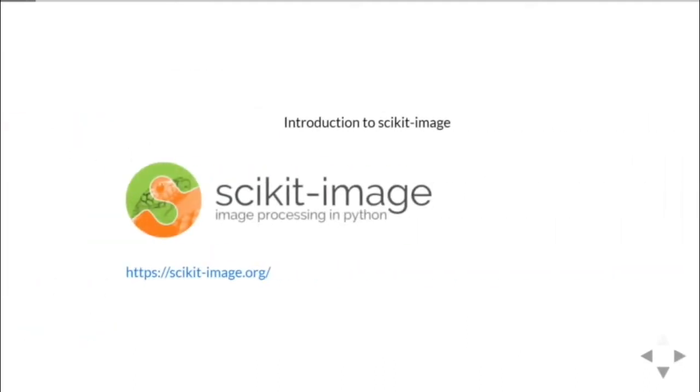So scikit-image is distributed as a Python package. Therefore, you can install it with pip or conda, and I recommend that you work in a virtual environment. Please refer to our website, scikit-image.org, for instructions on how to install the software package. If you're interested in the website, you will also find instructions on how to contribute to the project.